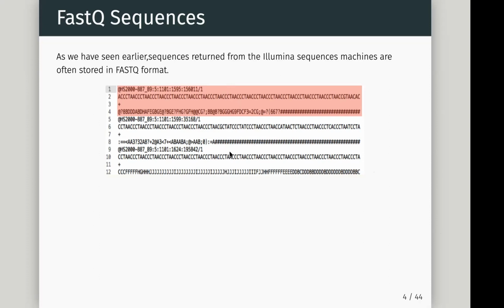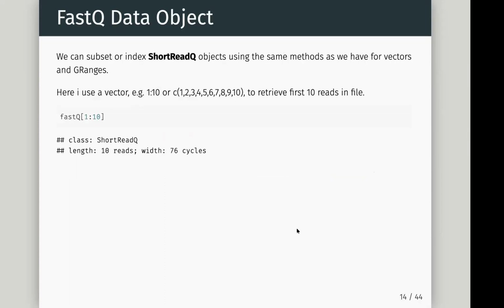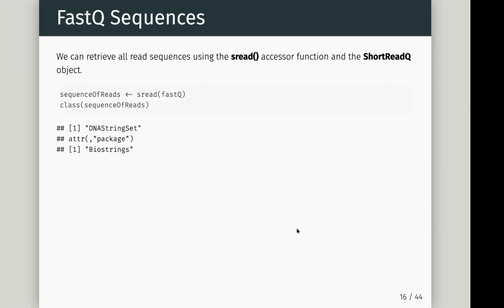Oh, well, you would just divide or normalize by the width, right? So we can get all the widths at the same time as a vector, and you could just do a vector division at that point, right? So you could have sum of the scores divided by the read length. Sorry, this is a question from Nathan, if anyone's wondering what I'm talking about. It's a good question though. I just want to talk it through for everyone as well, Nathan, because it's a good question.